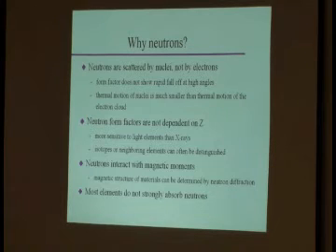Another one is most elements will not strongly absorb neutrons, while heavier elements absorb X-rays quite strongly, which means you can use pretty big samples. Now that can be a plus or a minus. If you work with really small research samples, that sucks, okay? If you are an engineer and you work with big pieces, some kind of functional pieces, and you want to look at something in those pieces, hey, this rules, because you can just put that piece right in the beam and you can go through it.